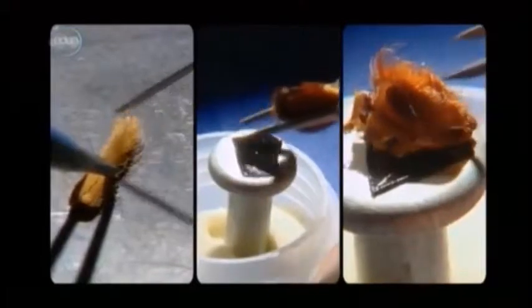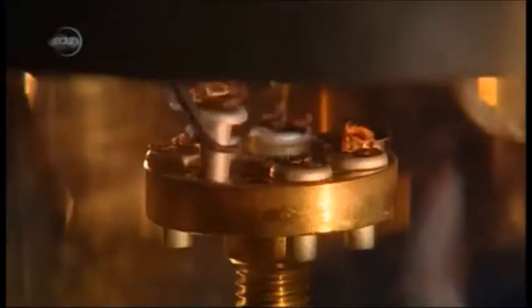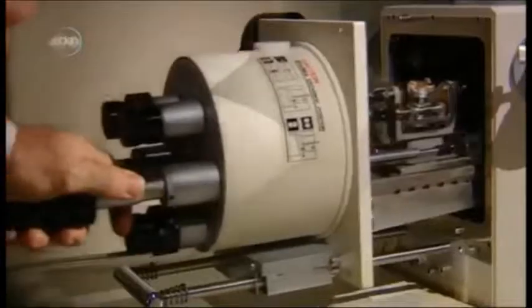Now this new tarantula species needs a name, and the truly painstaking part of Dr. Raven's research begins. All critical body parts are separated, cleaned and prepared for scanning under the electron microscope. Mounted on stubs, the body parts are placed into a vacuum machine and coated with an extremely fine layer of gold. The scanner can magnify the gold-plated limbs up to 50,000 times, making tiny hairs appear like massive tree trunks.